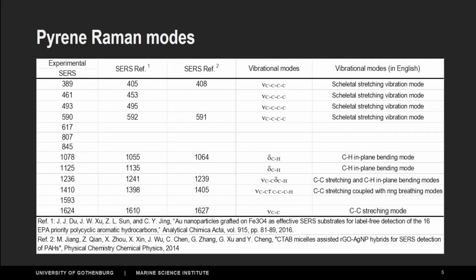You see those symbols there, and translating more into English, you see when the molecule starts vibrating, which bonds are vibrating or stretching, if it's the ring itself that starts dancing, or where exactly the excitation happens in the molecule.